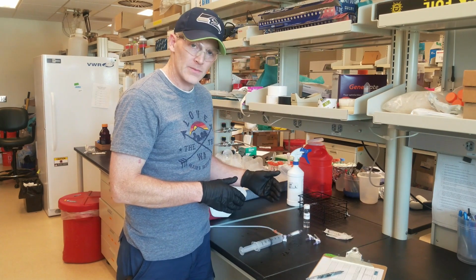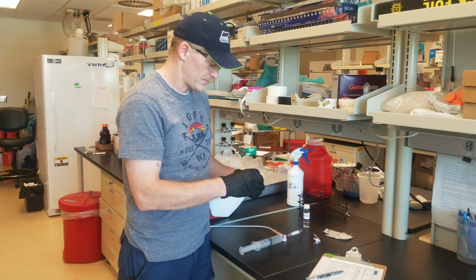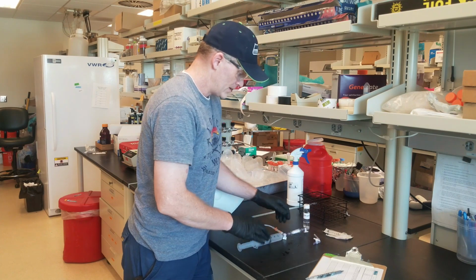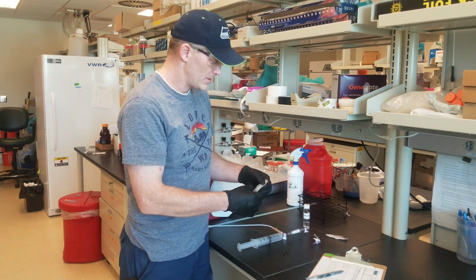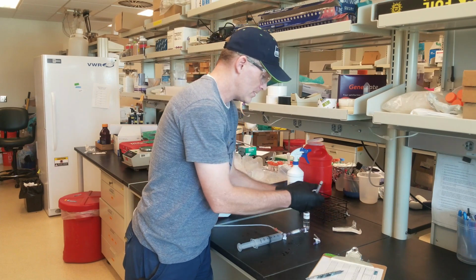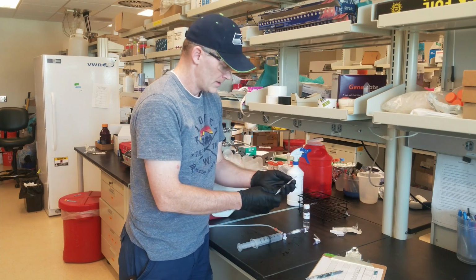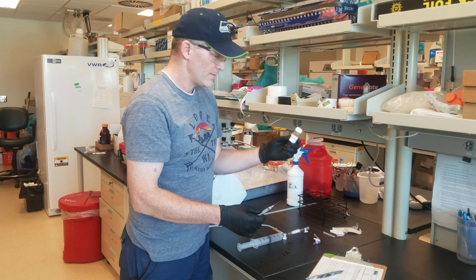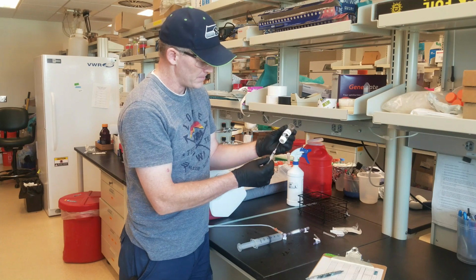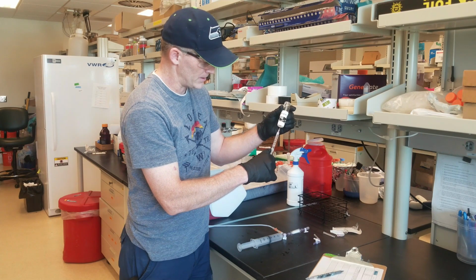The next step is to seal off the bottom of the Sterivex. For the video, we're using a closed valve, but we'll be sending along small Luer lock caps. So you're going to take your cap, put it on to the outlet of the Sterivex, screw it on there. Next thing you want to do is get a new 3 ml syringe, open that up, don't touch the outlet, get a new needle, open that, don't touch the inlet, put that together, take the cap off. The vial we'll be sending along has RNAlater in it. This is the preservative, so you can invert the vial, so the septum's on the bottom, go right through the septum, and then pull 3 mL, just fill the syringe, it's about 3 milliliters.